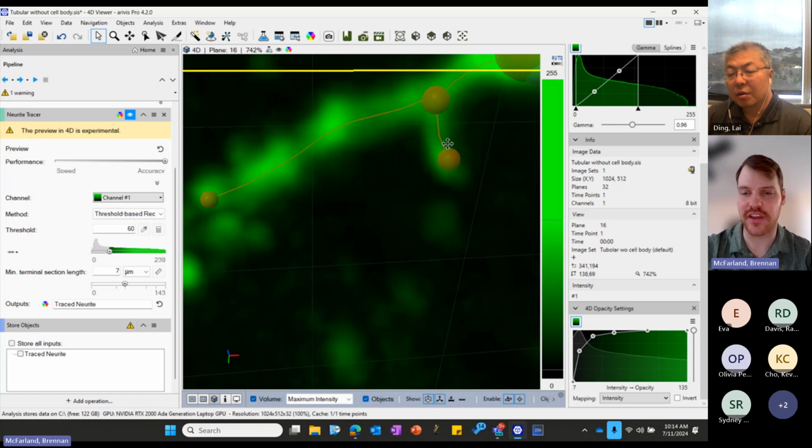And this is just a skeletonized version of the rendering. When we actually implement it, it's going to fill out into the gaps of where the intensity is. So it should smooth out and fill up and take the entire volume. Okay.